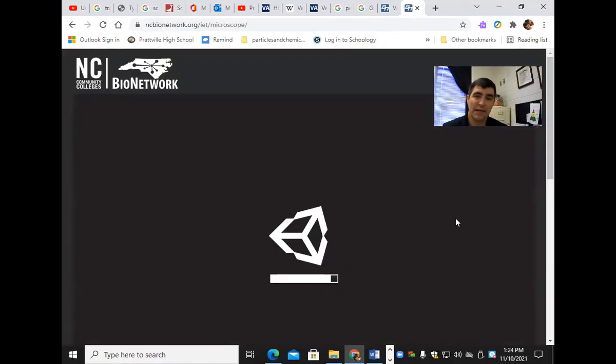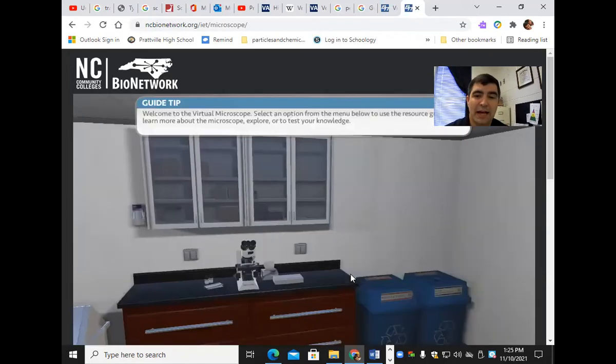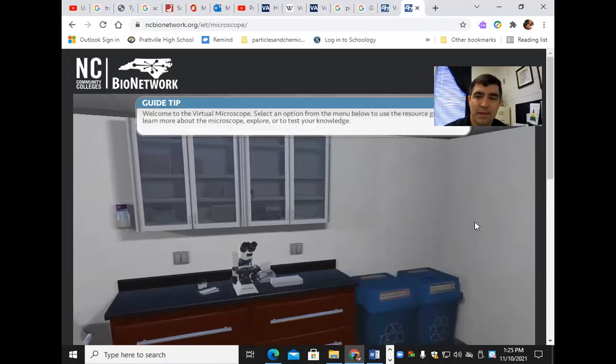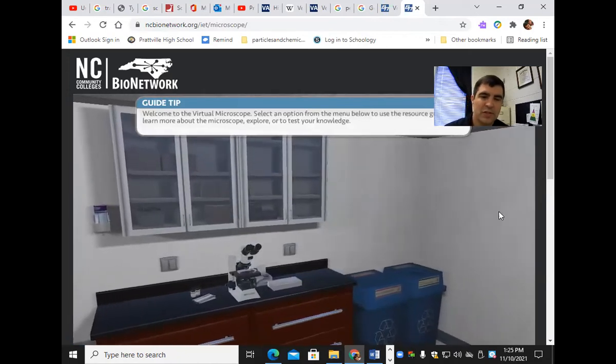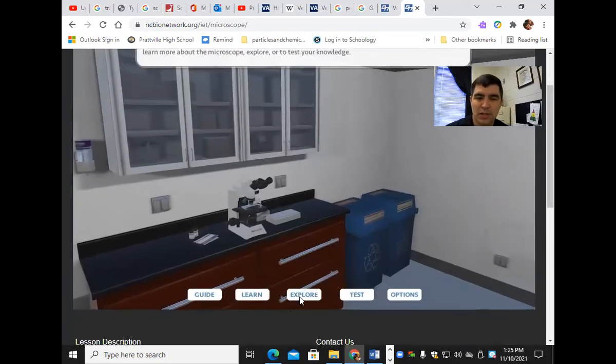When I get to the virtual microscope, it's going to show me this — it takes me to a simulated lab. You're going to scroll down a little bit and click 'Explore.' Then you're going to look at some of the different slides here.